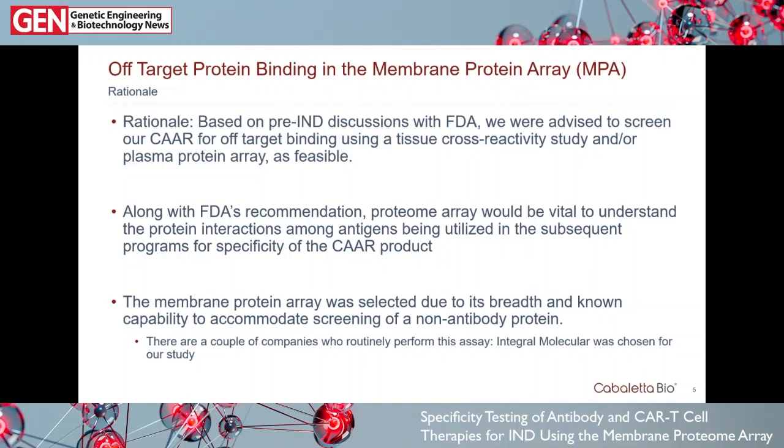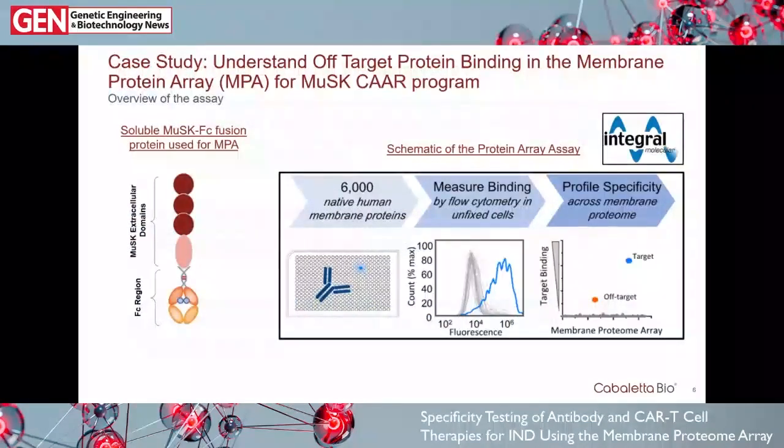But let's just jump into one of the studies that we did with Integral Molecular right now. All right, so let's look into the case study that talks about understanding the off-target binding analysis using the MPA technology for our MuSK-CAAR program.